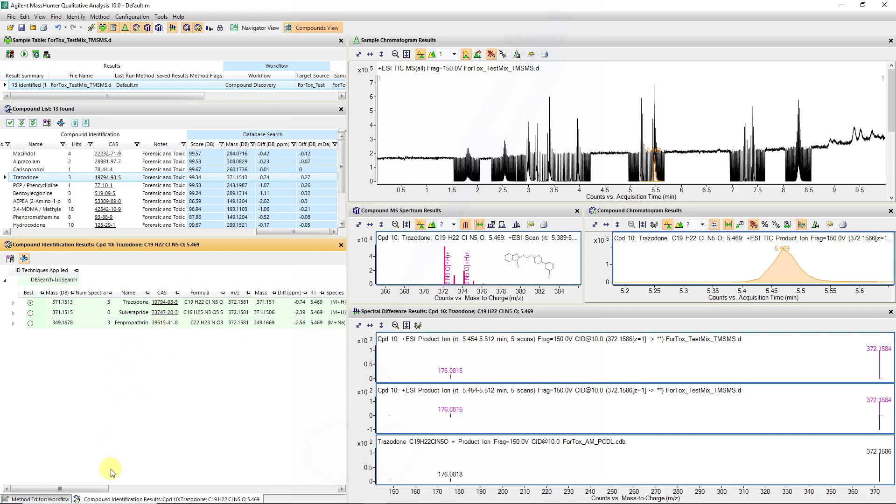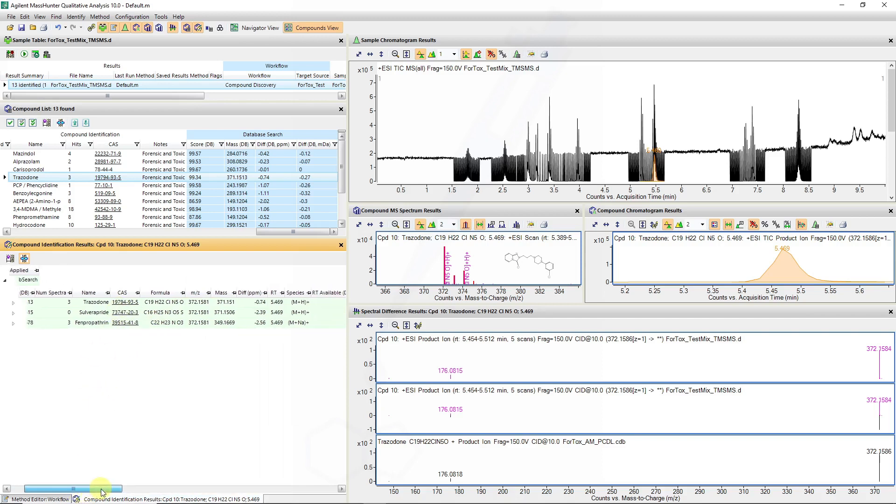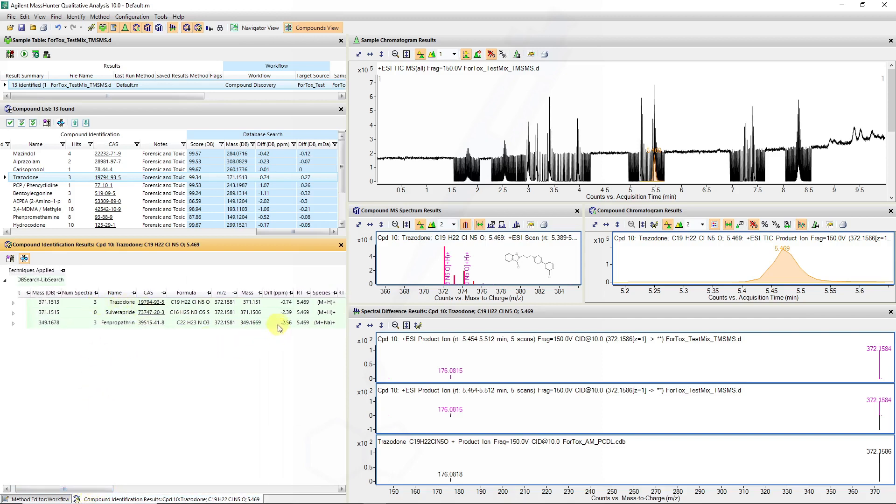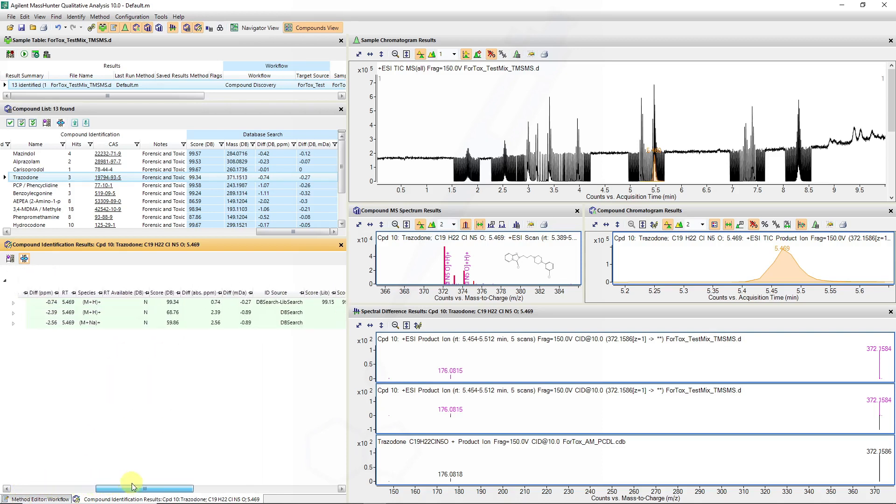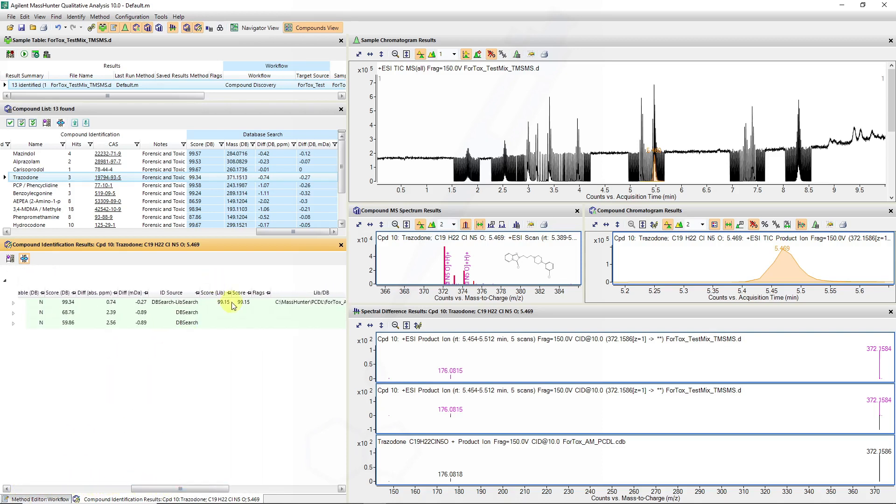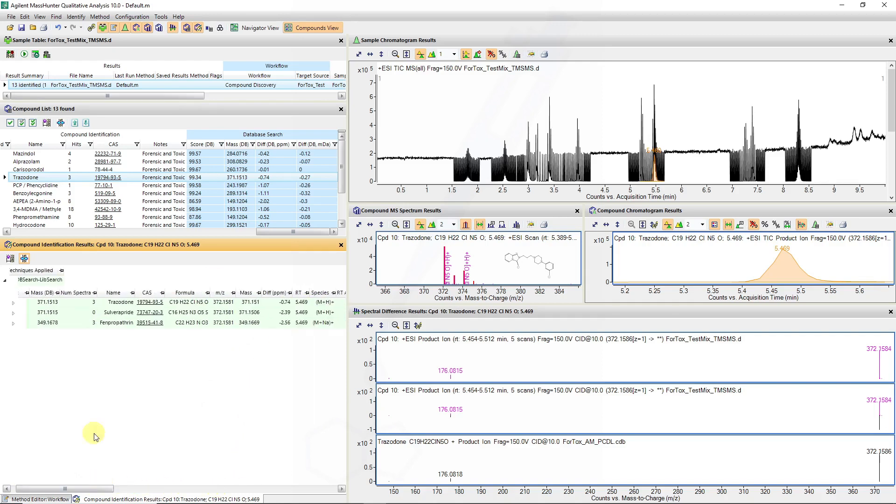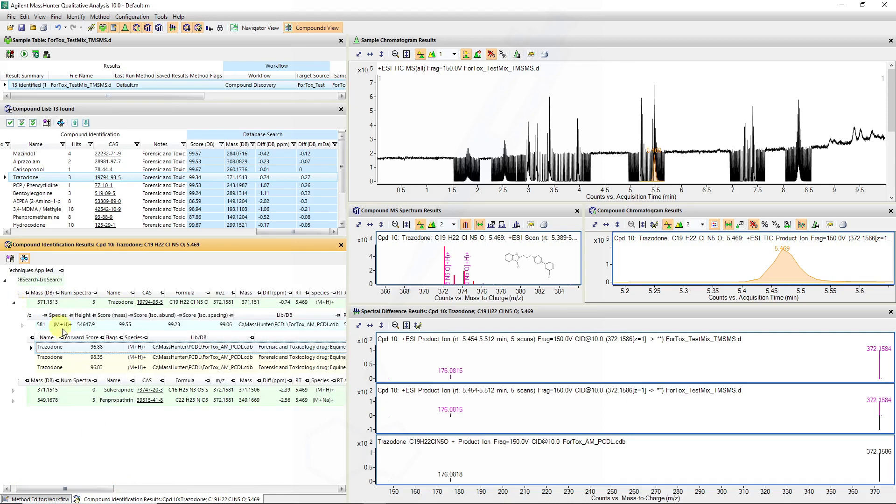And again in this case we can gain more confidence and see the trazodone was identified with the library score returning 95.15 out of these hits, giving us confidence that these other two molecules can be eliminated.